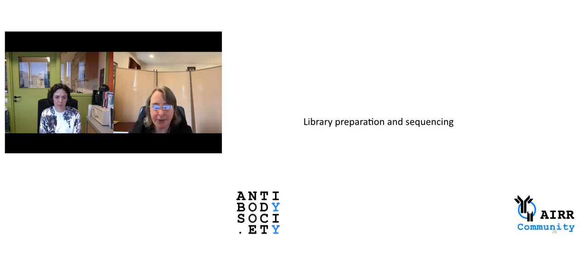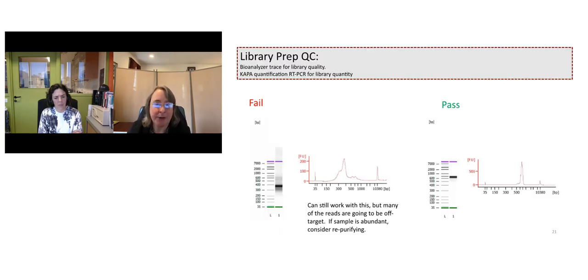Next, we want to look, again very briefly, at library preparation and sequencing. With many of these workflows, you have an initial round of amplification of your template, and then a second round where you generate your library with adapters. For example, if you're using Illumina, you'll have Illumina adapters on your amplified library, and you'll want to look at what that library prep looks like. This is an example with some Bioanalyzer traces, again showing you a nice library on the right with a really clean band at the expected size for the library products, and on the left, not as happy a situation.